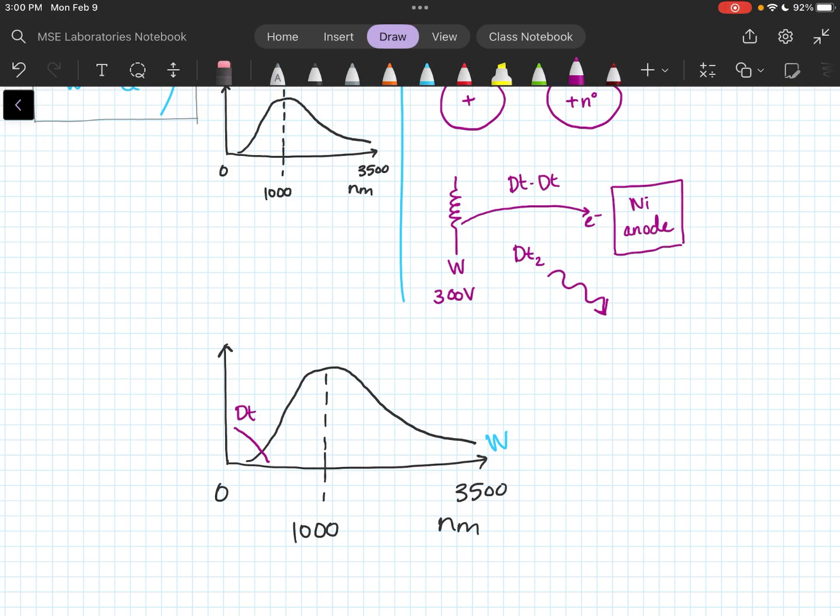And you can see the intensity of light changes a ton. Sometimes I have really intense light, like up here. Sometimes I have really low intensity, like whenever I make that switch over here. As well as up in the IR region, I have a little bit lower intensity light. So over the course of a test, we are going to see it's not just a constant, like 80 photons of every single wavelength. So the instrument has to calibrate those things out.